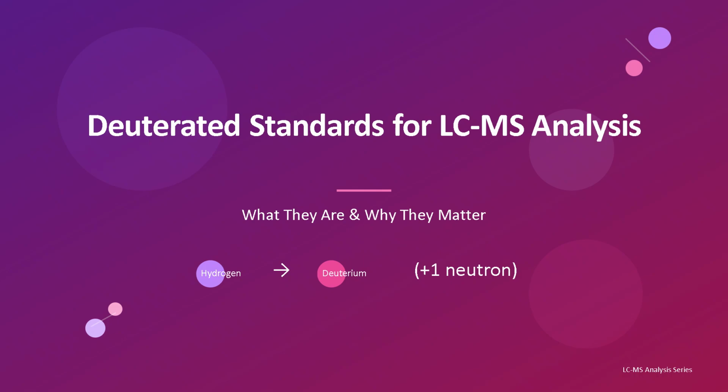Welcome to this session on deuterated standards for LC-MS analysis, what they are and why they matter. In analytical chemistry, especially in LC-MS workflows, accuracy isn't just a goal, it's a necessity. Today, we'll explore how simply replacing a few hydrogen atoms with deuterium can dramatically improve the reliability and confidence of your results.